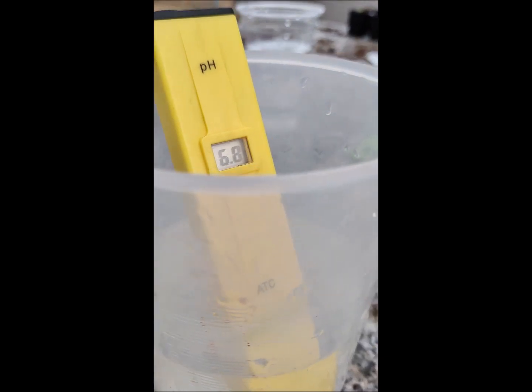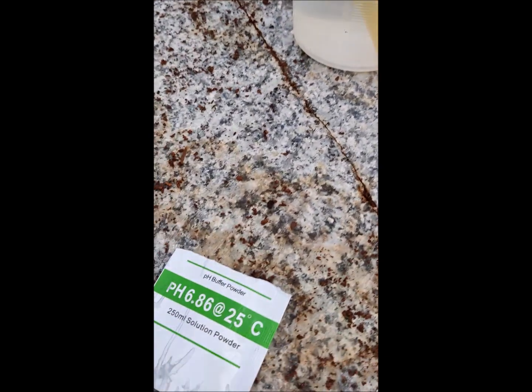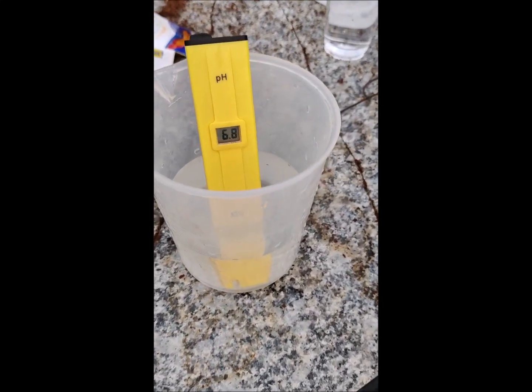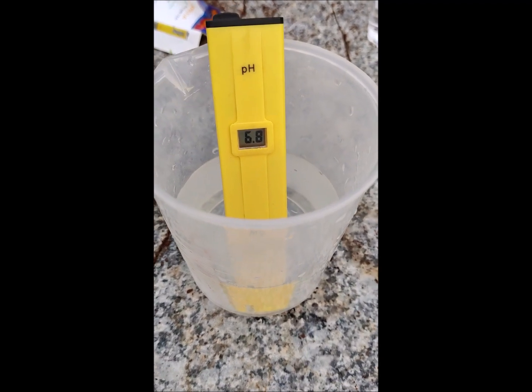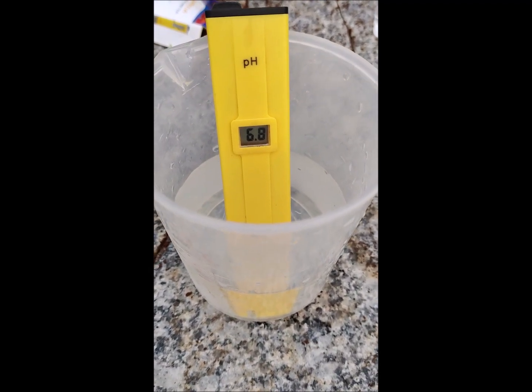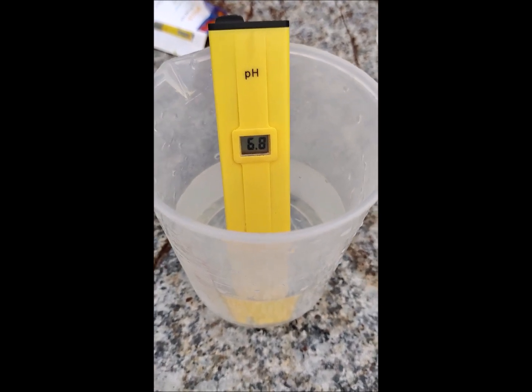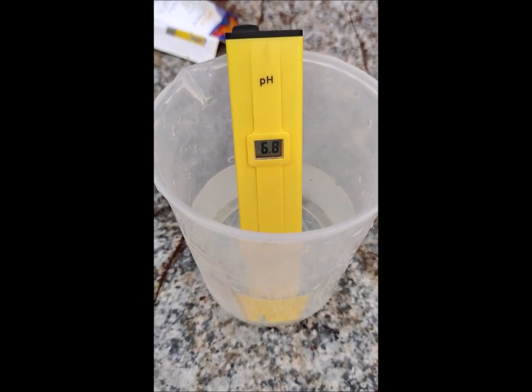So now this is the way we calibrate it. So it is giving the reading of this pH calibration solution, and your pH is calibrated, which was 5.1 or 5.2. So you just imagine, around 2 units of pH was not right. So that's the way it is important.